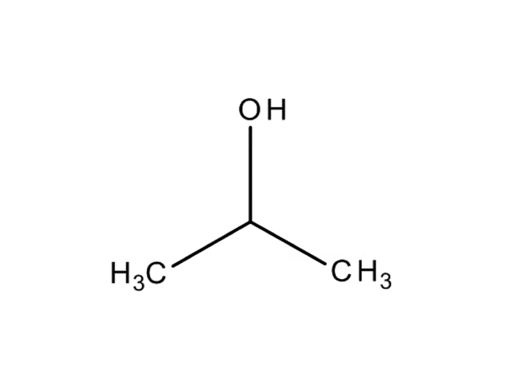Your second solvent was propanol. Okay, and you can see from its structure that it is a covalent compound, and on the central carbon you can see a hydroxyl group, which gives it a little bit of polarity, but not nearly as much as you had in the water and the salt solution.